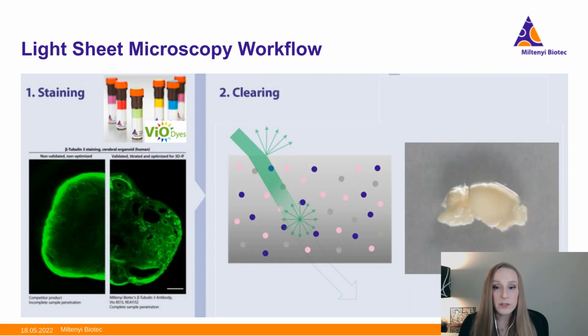The next consideration is the tissue clearing that you heard me talk about before. In normal live or fixed tissue, different materials within the tissue, including things like water, proteins, and lipids, impair the light passage. You can see this in the middle, a schematic of a simplified view of tissue and all the materials that would be causing things like reflection, refraction, scattering, and absorption. And this really decreases the light penetration, detection, and ultimately the image quality. So that's why you get something like the image on the right of this brain, and it's very opaque. So the goal of tissue clearing is to render the tissue transparent to reduce these impairments for better imaging.